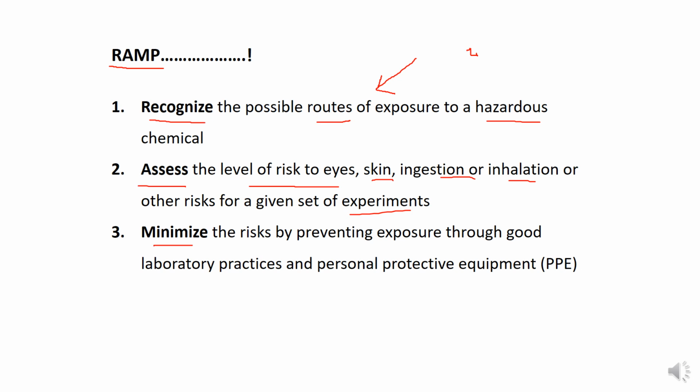Minimize the risks by preventing exposure through good laboratory practices and personal protective equipment. So of course, how can you minimize it? First identify the routes, then assess, and then minimize by using good practices as well as PPE, personal protective equipment. So you can use proper PPE to minimize whatever the exposures are.